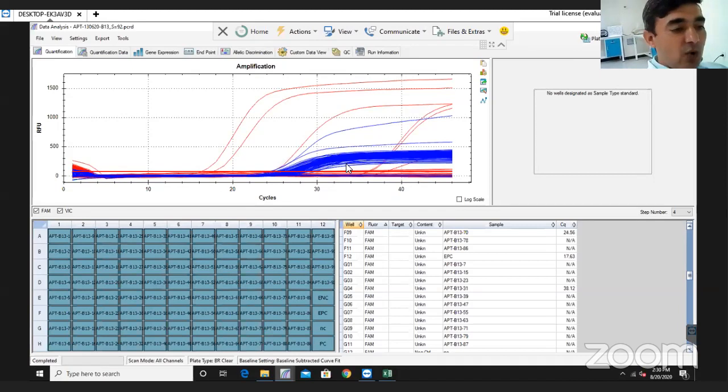Similarly, what is the CQ value for positive and negative cases? Yes, this is really important information to share with you. Look at what we basically do in that particular case.